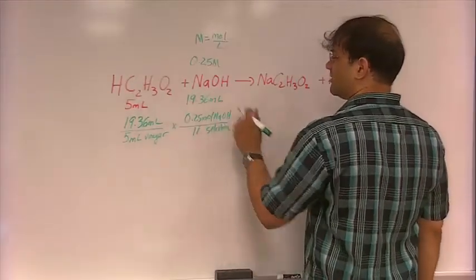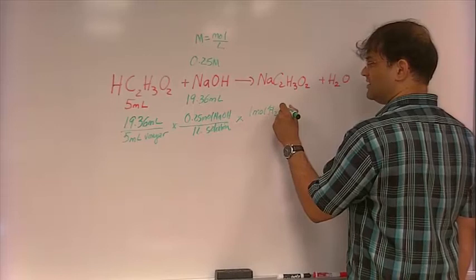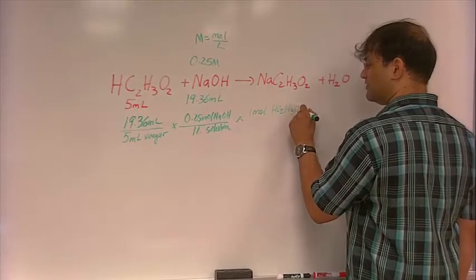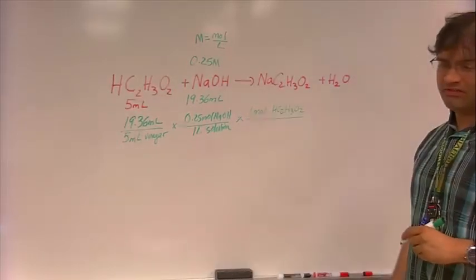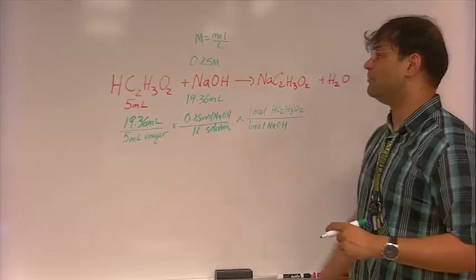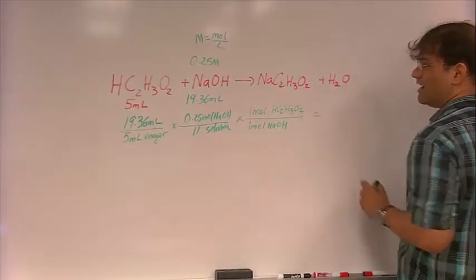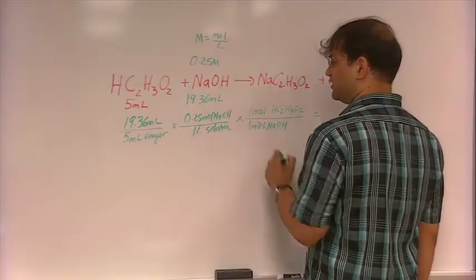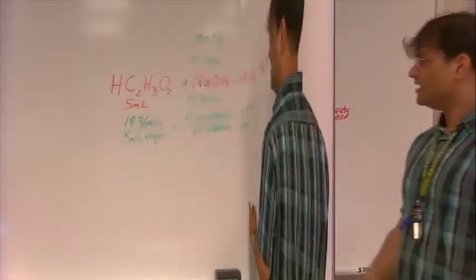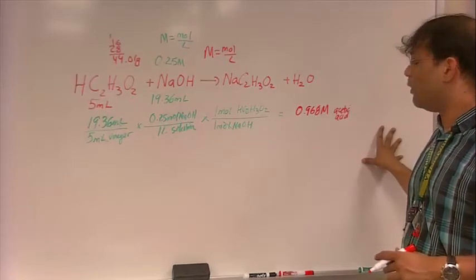And based on this chemical equation, we know that for every 1 mole of acetic acid, HC2H3O2, we have 1 mole of NaOH. That's one of our definitions of the mole, coefficients of a balanced chemical equation. Okay? When you do that, this mole of NaOH cancels with this mole. This mil cancels with this mil. And so when I do this calculation, I get, for my titration, yours may be different, 0.968 molar, so moles per liter.